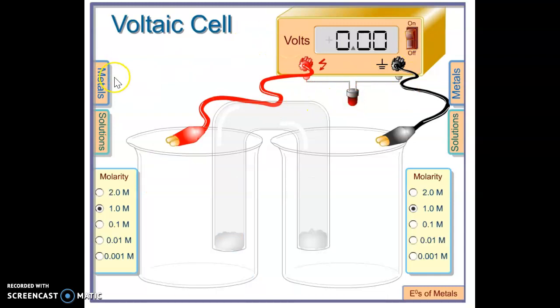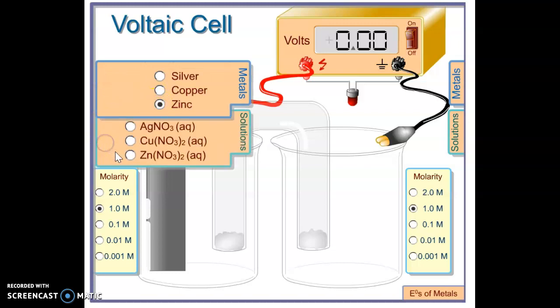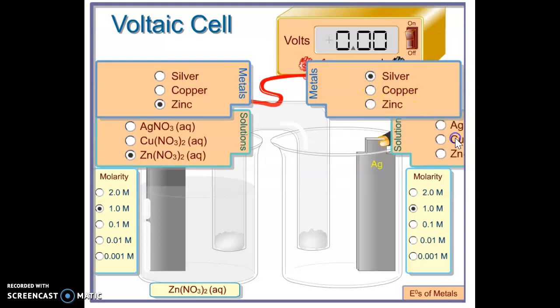All right. On the left, we've got zinc in our zinc nitrate. And on the right, we've got silver.